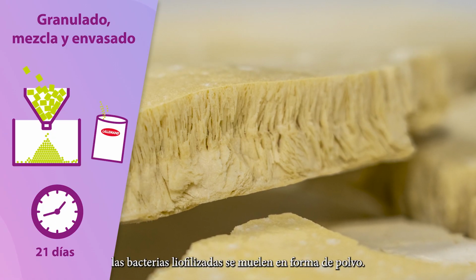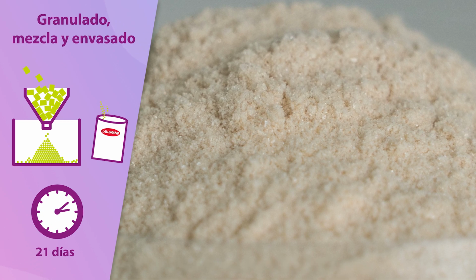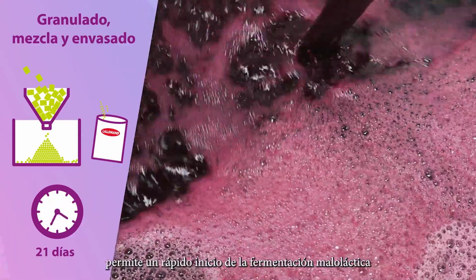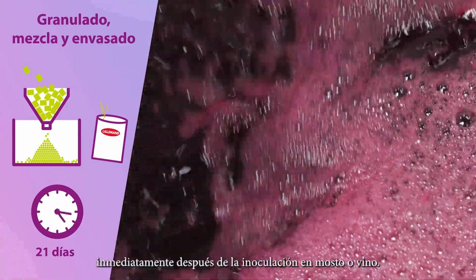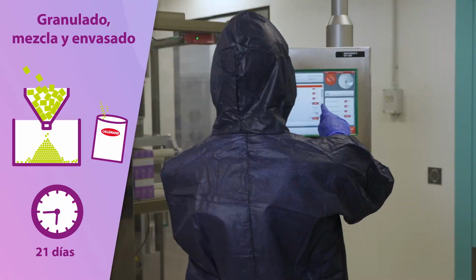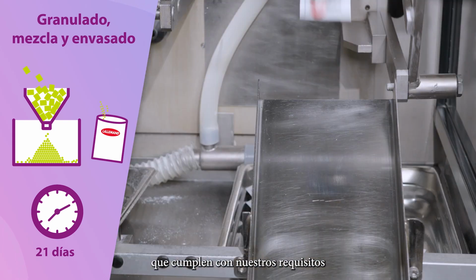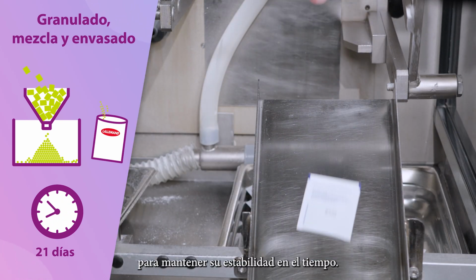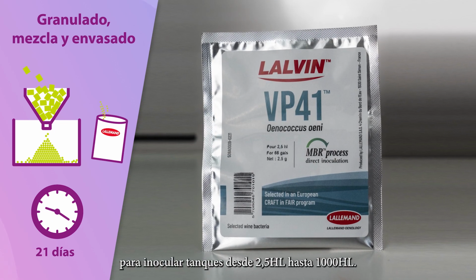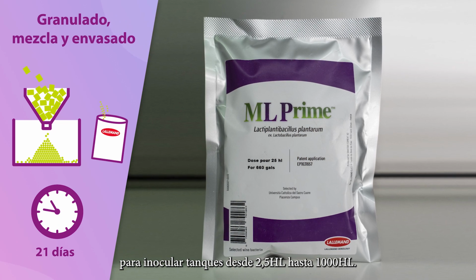Subsequently, the freeze-dried bacteria are ground to powder form. The population of living cells per gram of powder allows a quick start of malolactic fermentation right after inoculation in must or wine. Finally, the bacteria are packaged in specific sachets meeting our requirements to maintain their stability over time. We have different sachet sizes to inoculate tanks from 2.5 hectoliters to 1,000 hectoliters.